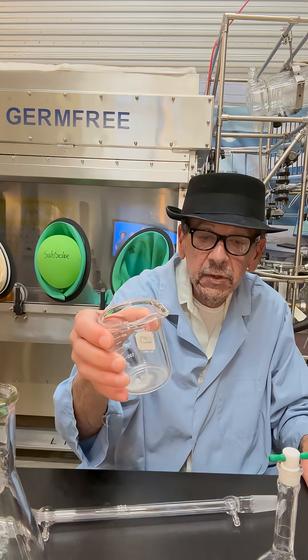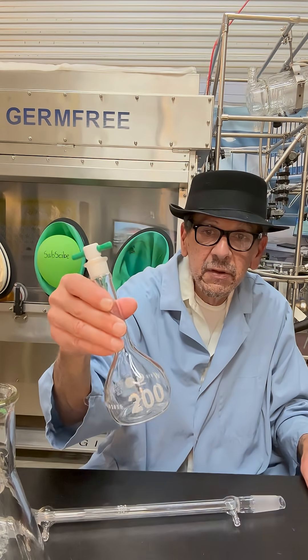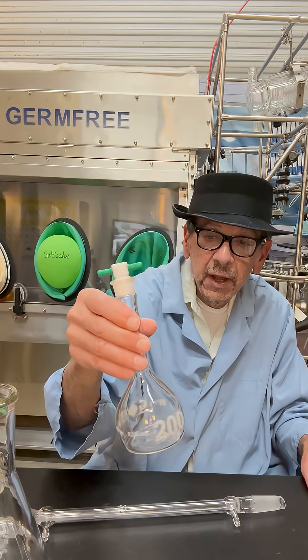This is a 250 mil beaker. This is a volumetric flask.